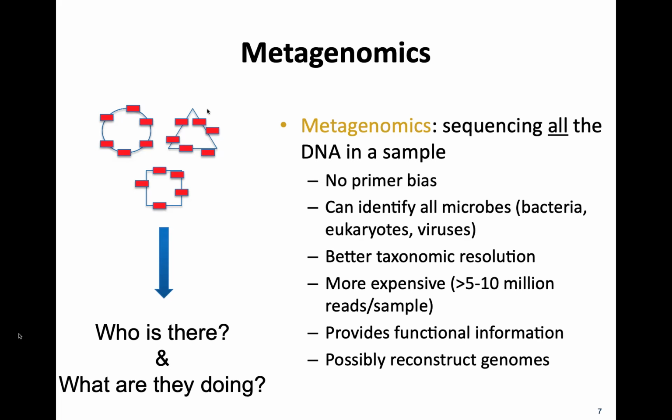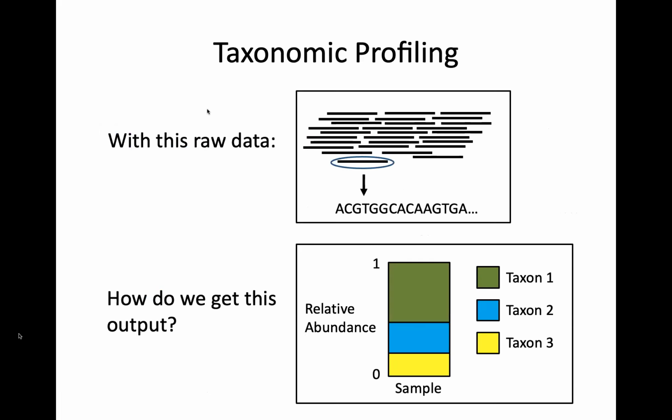Okay, so pretty straightforward here on the taxonomic profiling, which we're going to focus on in this lecture a bit more. We'll save the functional stuff for the afternoon. And if you don't have metagenomic data and you only have 16S, you might be thinking, can I just tune out the whole day? No, you don't want to do that. It's nice to know about other technologies. And sometimes I would have a separate PICRUSt lecture. I will mention PICRUSt in this afternoon's lecture, and that will give you some idea of how, if you have 16S sequencing, you might be able to get some functional information. So it'll come back around.